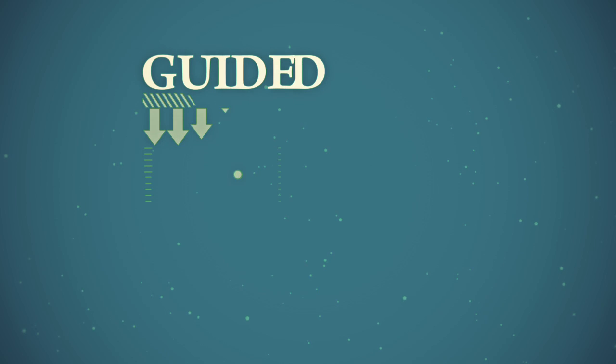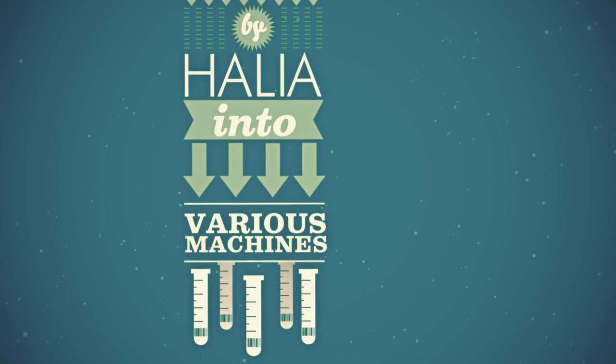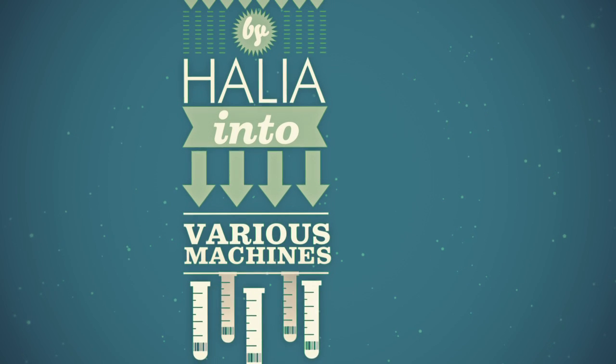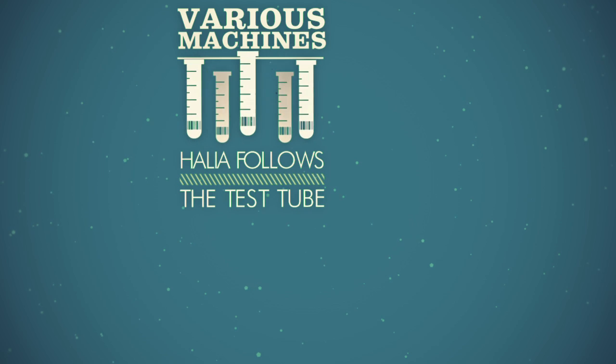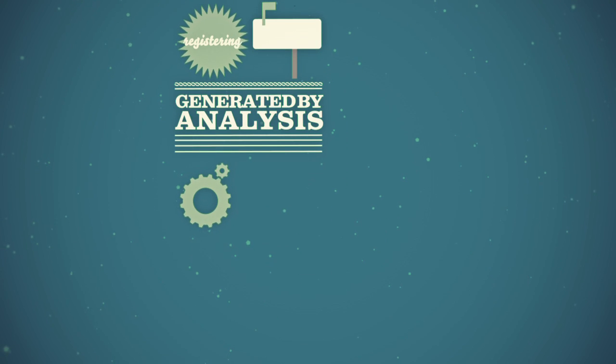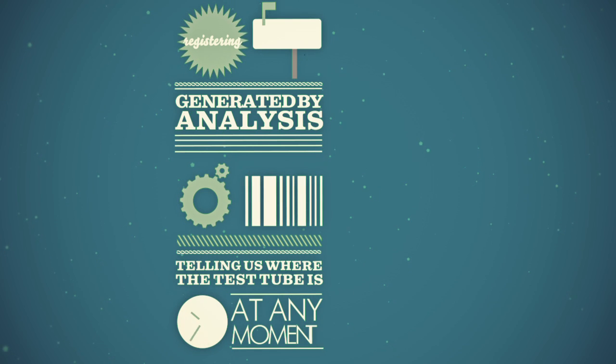The test tube is guided by Halia into various machines where the various tests are done: glucose, CBC, TSH. Halia follows the test tube, registering data generated by analysis as the barcode on the test tube is read, telling us where the test tube is at any moment.